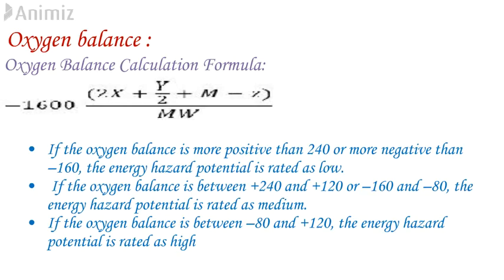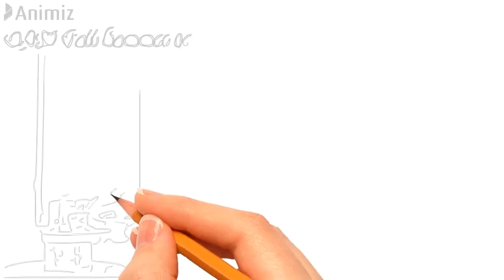Hence, before taking any material for oxygen balance, the exercise has to be checked, to see whether it is a candidate for the OB exercise or not, with the help of the previously given table. Determination of explosivity or shock sensitivity of material using the BAM fall hammer test. It is very important to know whether a material is shock sensitive or not. Shock sensitive materials are to be stored separately under certain conditions.